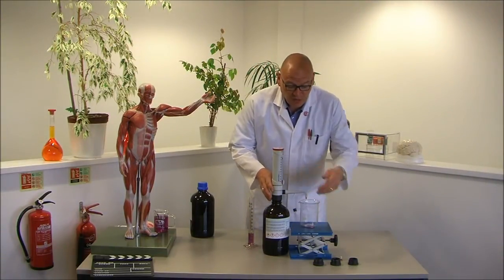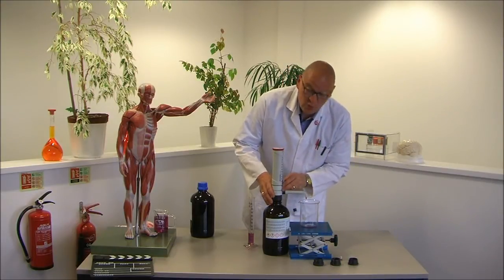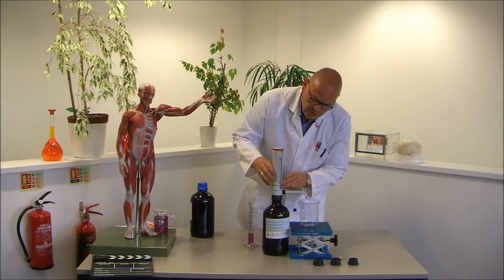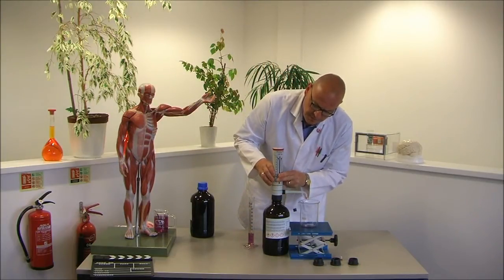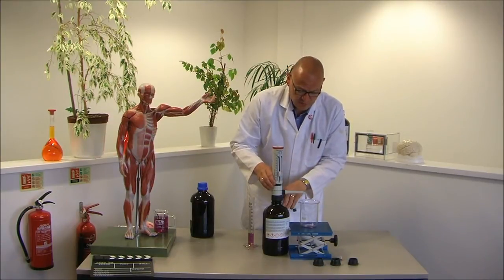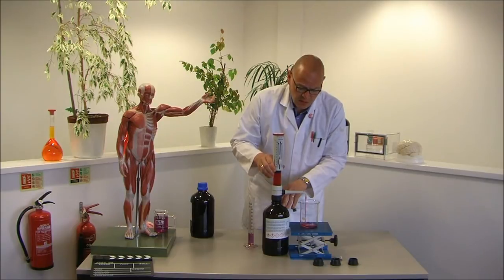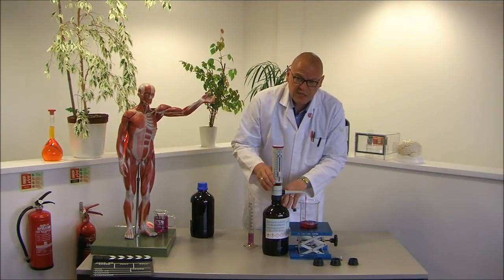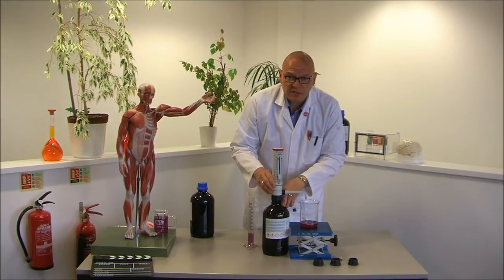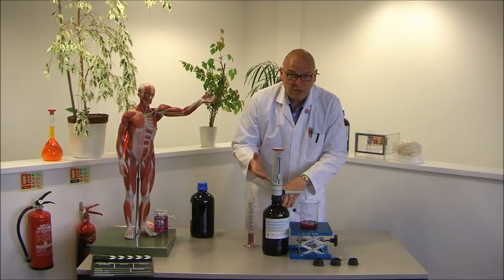The dispenser is supplied with a selection of bottle top adapters. It also comes with a filling tube that you cut to half the length itself. The volume is set with this little button here. Once primed, it's simplicity itself — the liquid's drawn up and simply dispensed. Excellent accuracy, great repeatability. An absolutely superb product. Reasonably priced too.